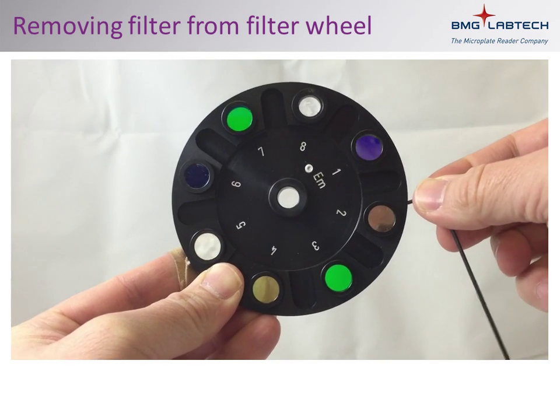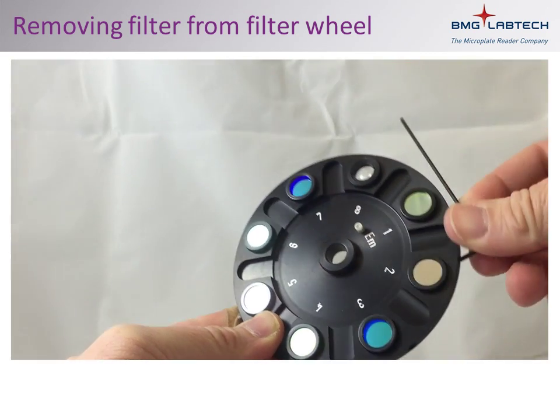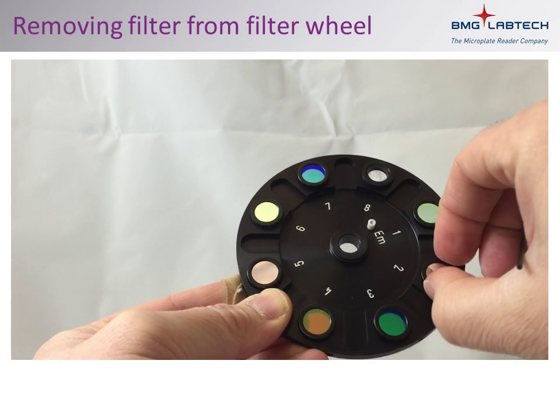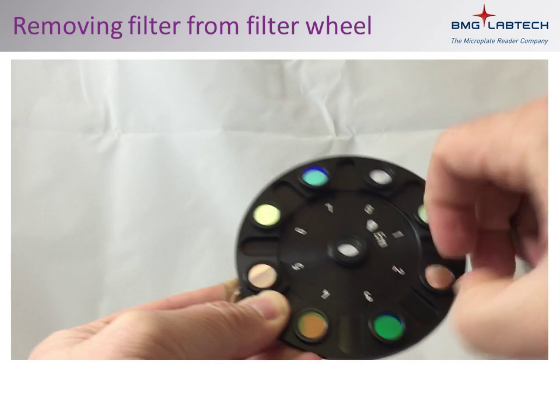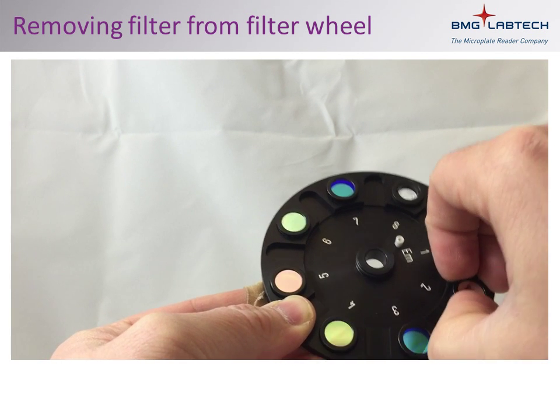Using a 1.5mm Allen key, loosen the small screw on the edge of the filter wheel that holds the filter in position. Being careful to handle the filter only by its edges, remove the filter from the filter wheel.